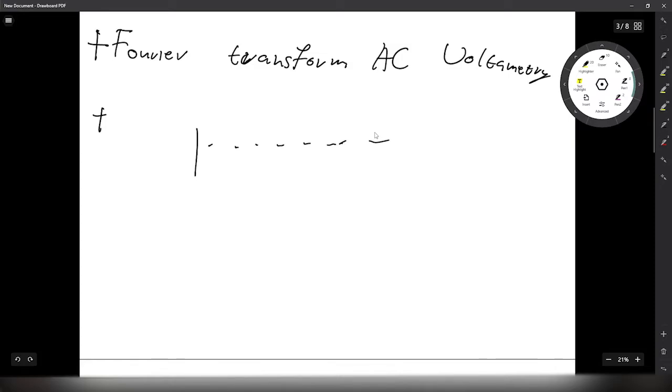It generally just simulates the line to be quick, and it will do normally between 2 to the power of 17 data points in the PDEs, assuming fixed diffusion in solution and either Butler-Volmer or Marcus-Hush on the surface of a working electrode here. That's pretty much that for that.